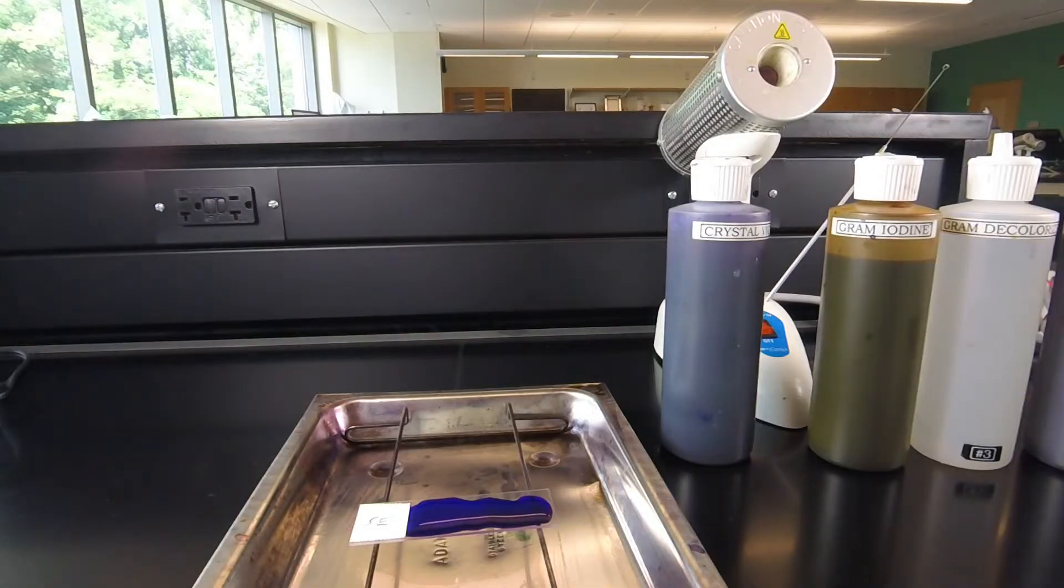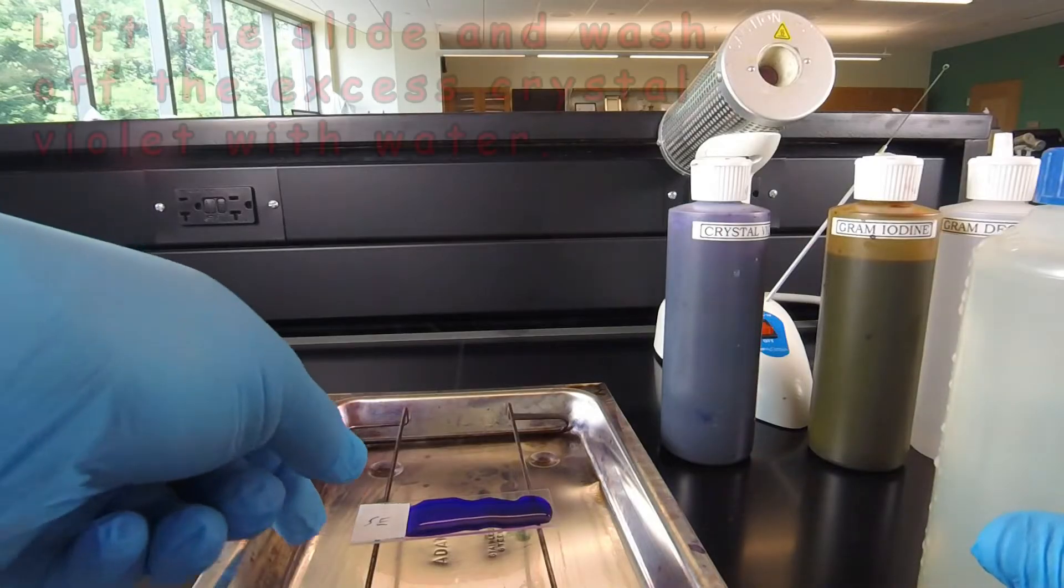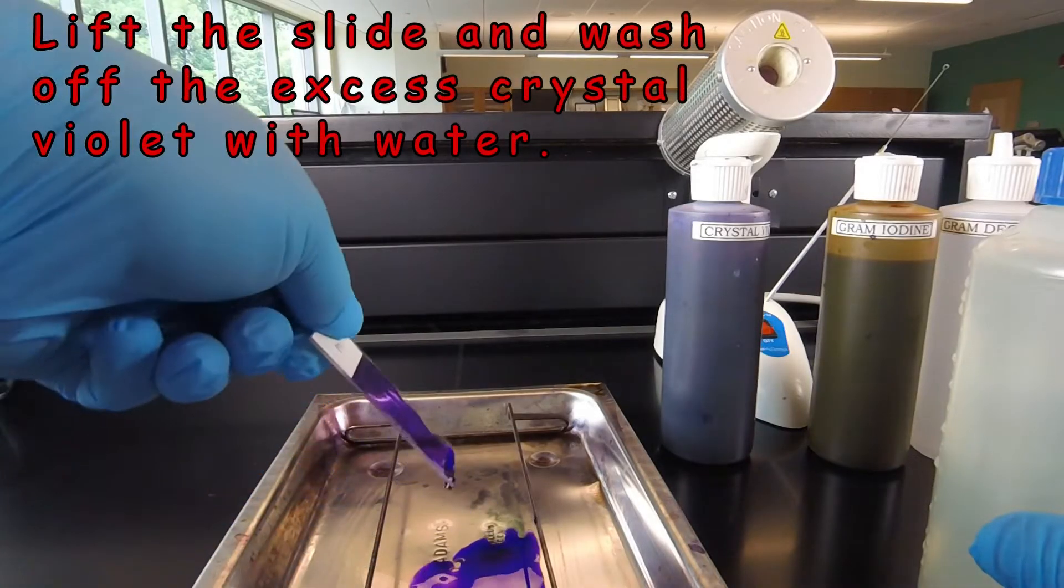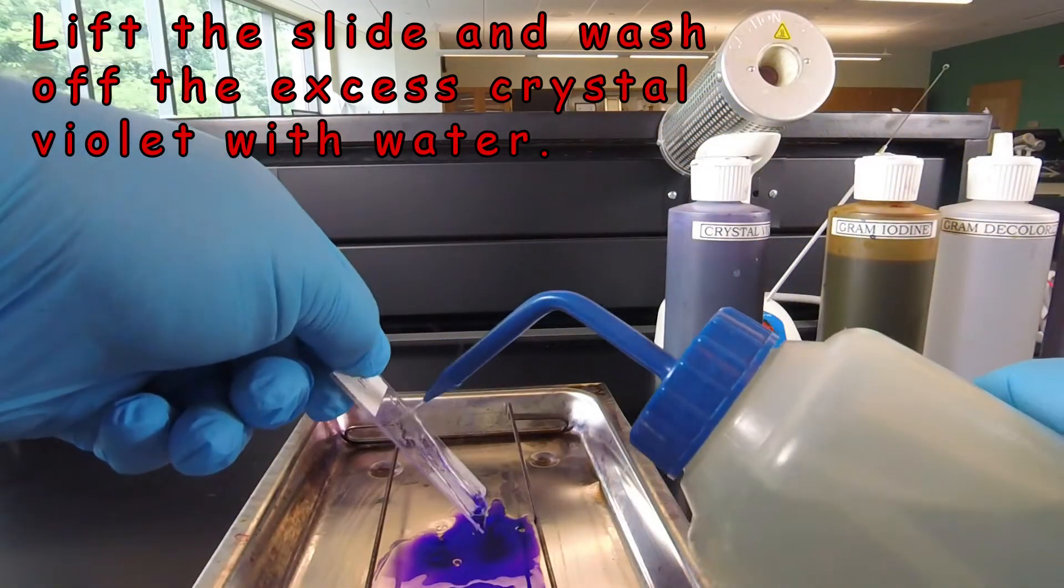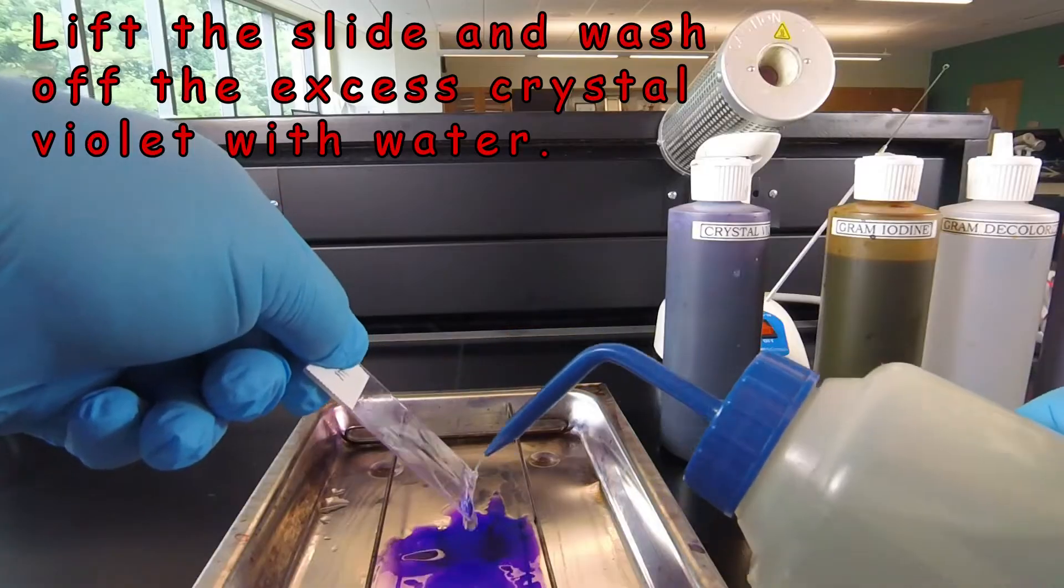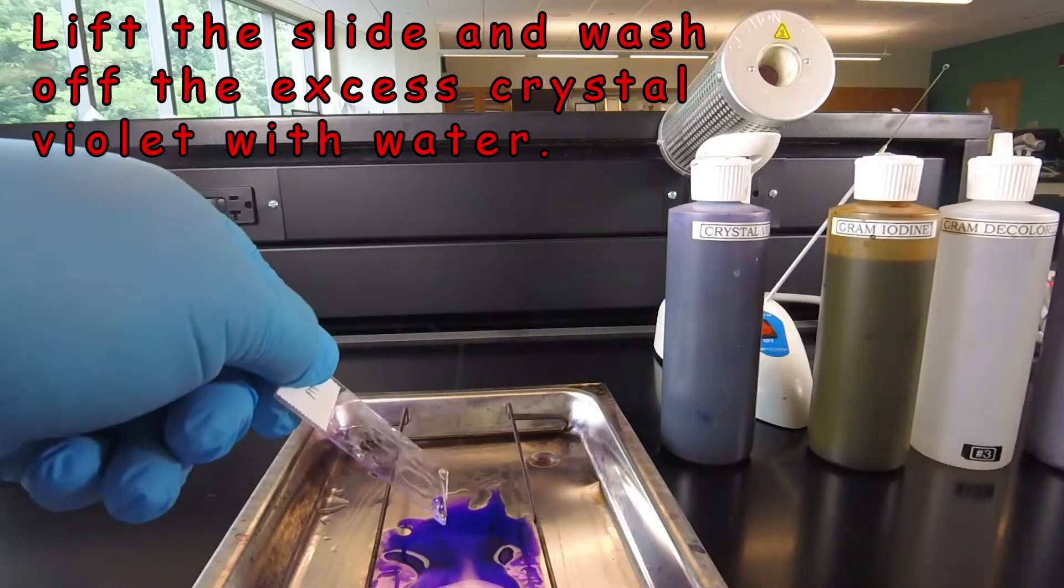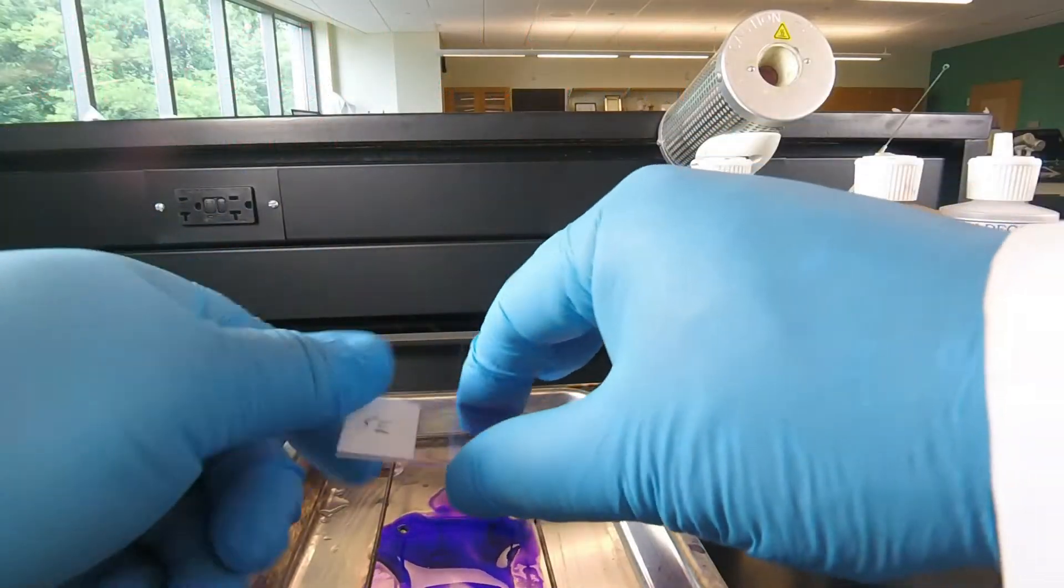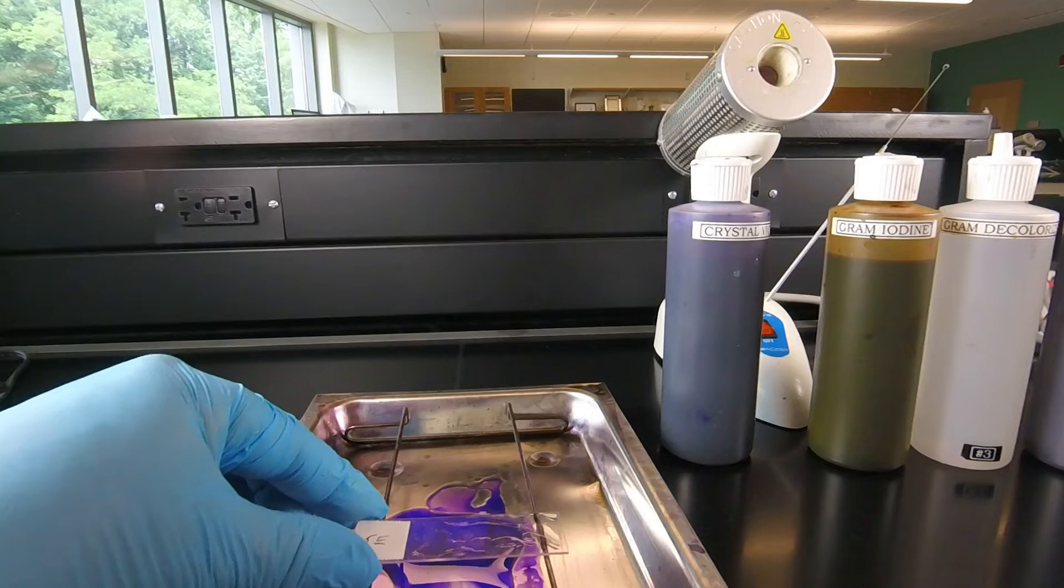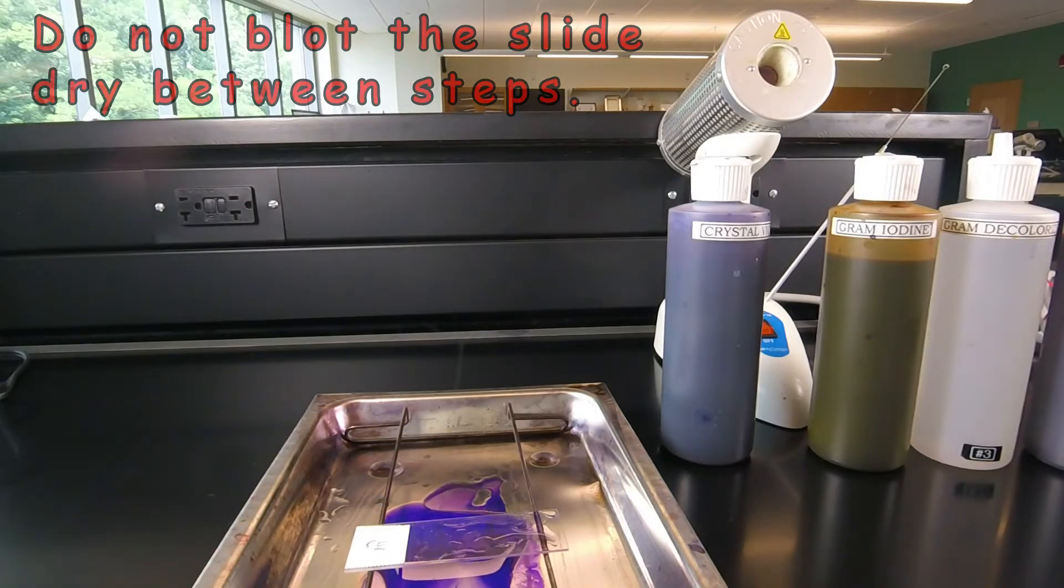A minute has gone by. We're ready to wash off the excess crystal violet with deionized water. We pick up the slide by the label, hold it over the staining tray, and direct the water at the top of the smear, letting it run down over the slide while watching the bottom. As soon as the purple starts flowing off, we shake off the excess dye, put the slide back on our staining tray. We don't blot dry between steps; we simply go on to the next step.